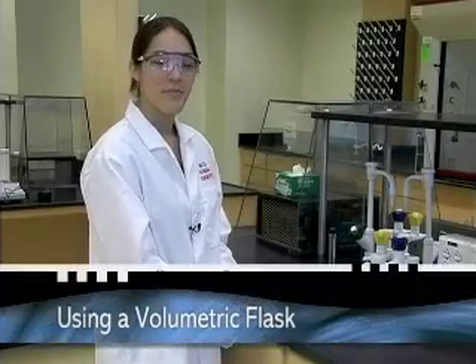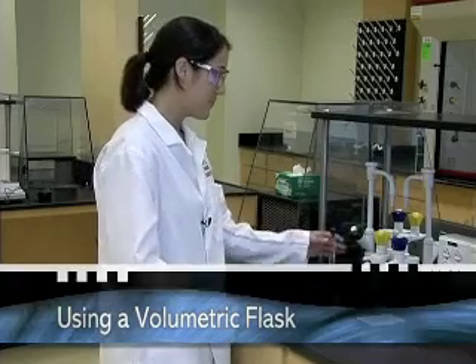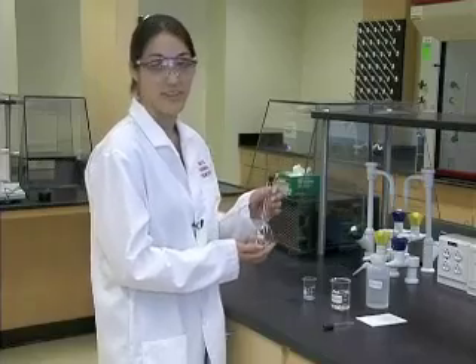Hi, I'm Lindsay and I'm going to show you the correct use of a volumetric flask. A volumetric flask measures a set volume, in our case 100 milliliters.